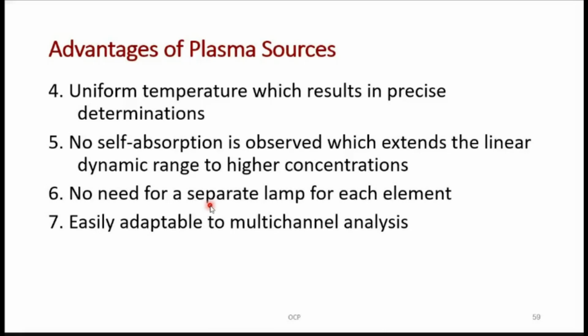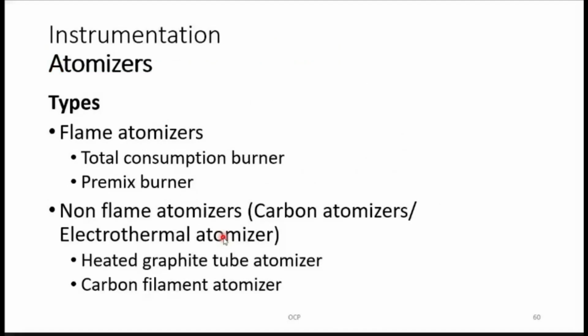So different lamps will be required for every element. Here it is not needed. Easily adaptable to multi-channel analysis. That means you can analyze multiple analytes in a single go.